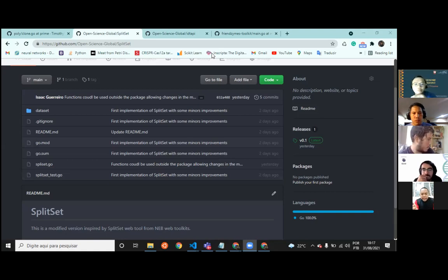And MinION has graciously packaged everything together in an automated workflow software such that all you have to do is provide your reads and the reference, and then it just goes and assembles everything together. So basically that's it.